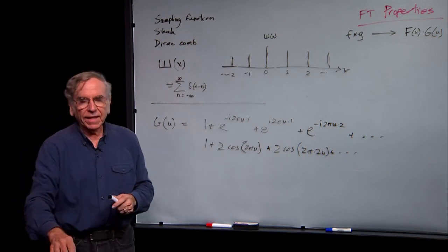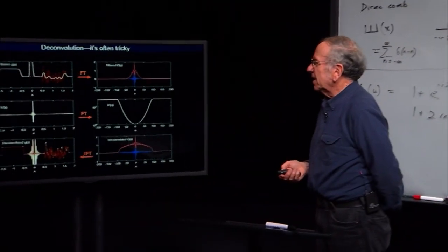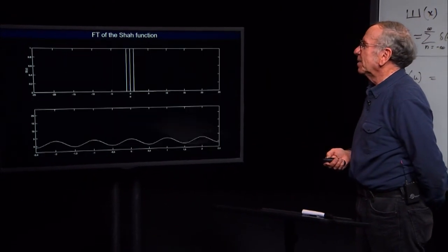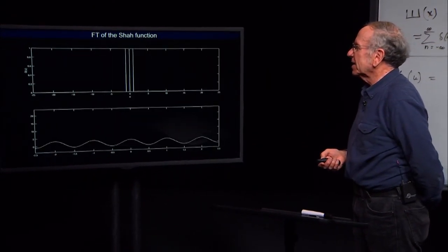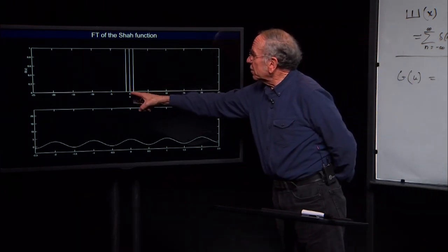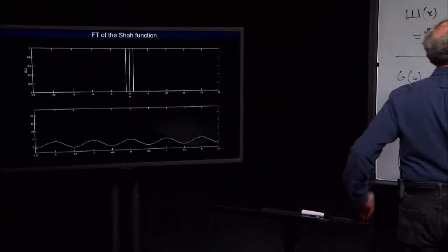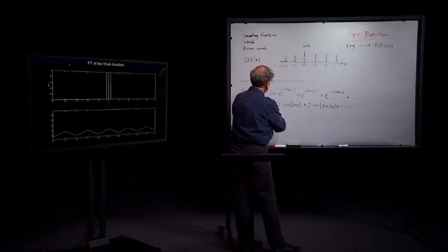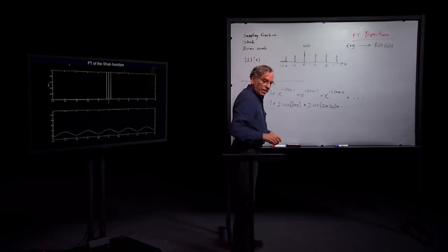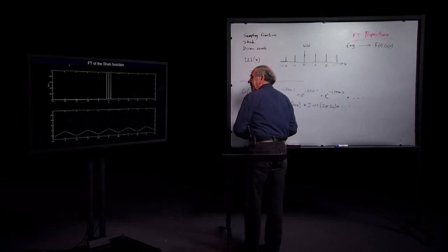It looks like that. So it's not easy to prove, so I'm going to give you a numerical example. So here are three delta functions, the delta function at 0 and at +1 and at -1. So I've just picked up this much of this infinite series of terms, and there it is.